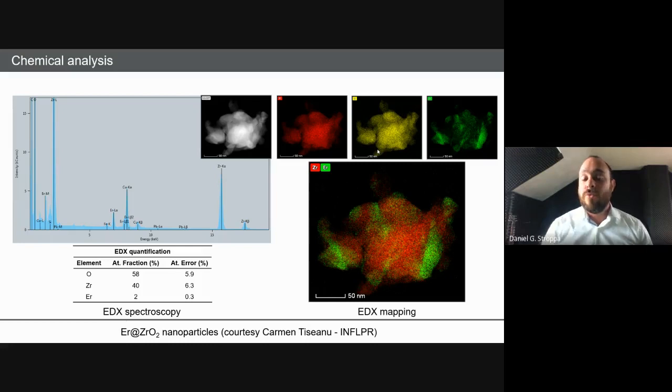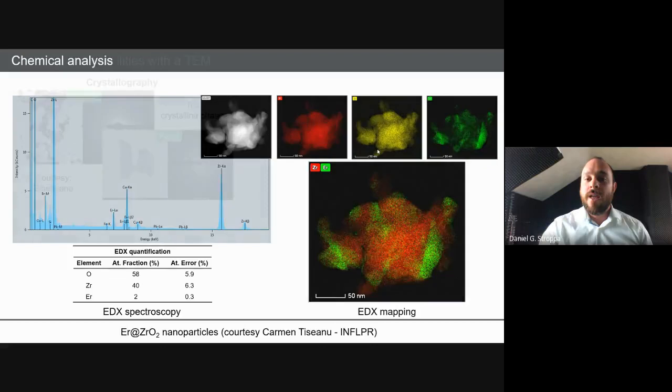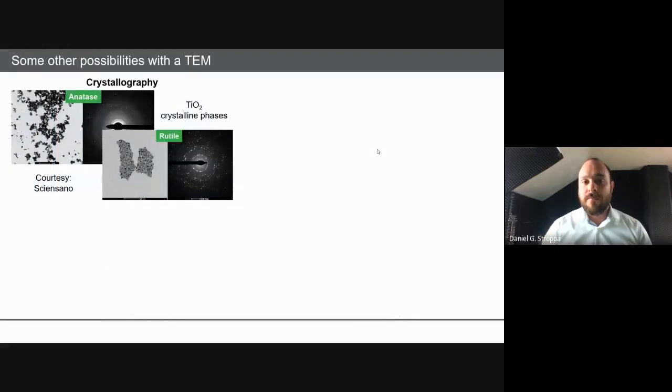So you can recover structural information directly from the diffraction result. You can do tomography. In tomography experiments, you're essentially tilting the sample and acquiring multiple images or multiple chemical maps. And then from these projected images, you can reconstruct the 3D shapes. Then you can reconstruct 3D morphology and even chemical segregation in 3 dimensions.